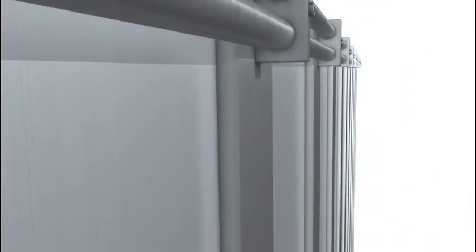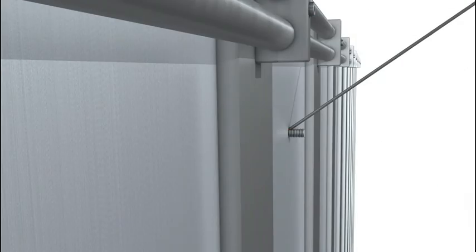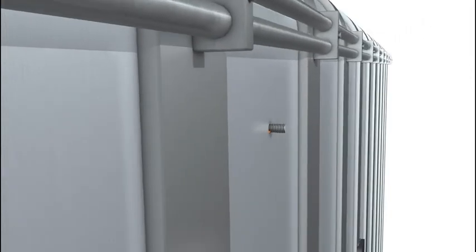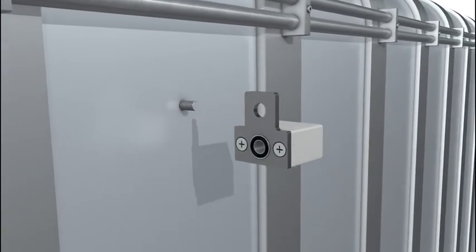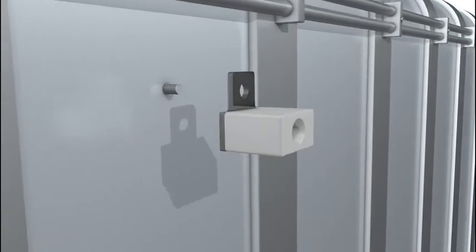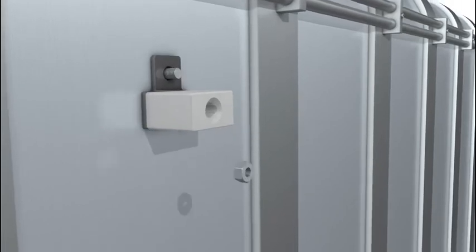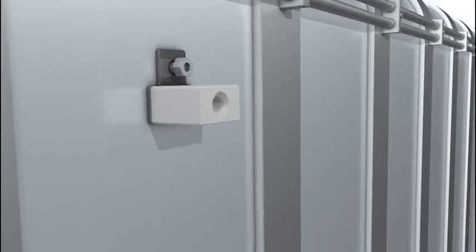A tank solution is available whereby the device is bolted to a weld stud on top of the tank wall. This easy to handle solution is shown here. The stud is welded to the tank, the clamp block is tightened down and the measuring device can be inserted.